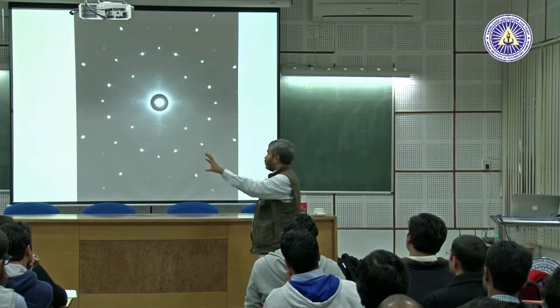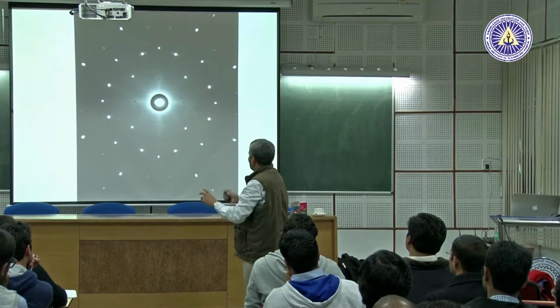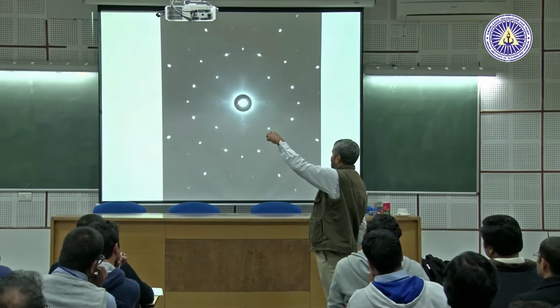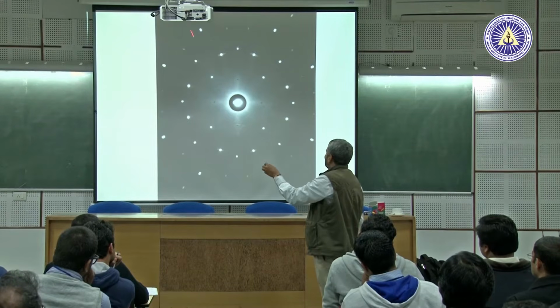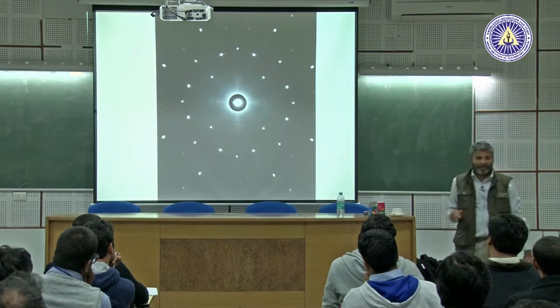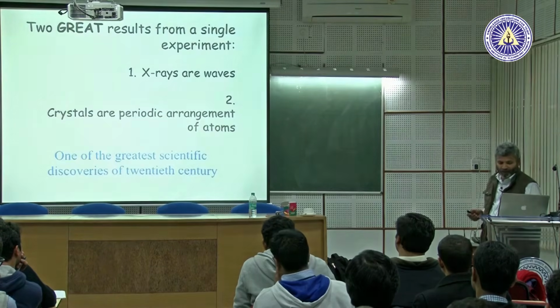Ashish will teach you more about this. And the crystal is somewhere here. The X-ray is coming along the laser direction. If the crystal was doing nothing, with only transmission, then only a transmitted spot should have been there. But after interacting with the crystal, beams go in different directions and are recorded on a photographic film, which coincides with the plane of the screen here. So this is Laue's technique, and a beautiful diffraction pattern like this can be found.